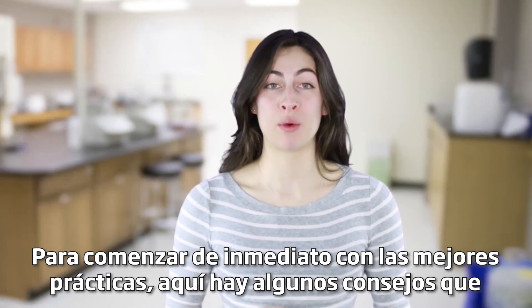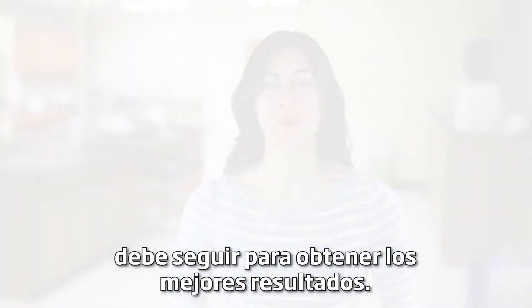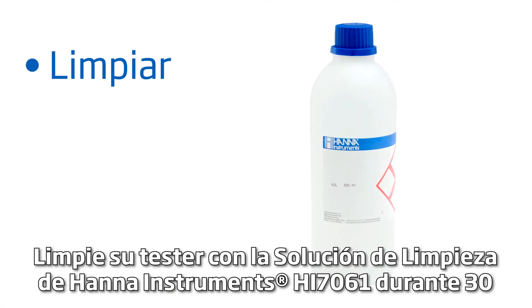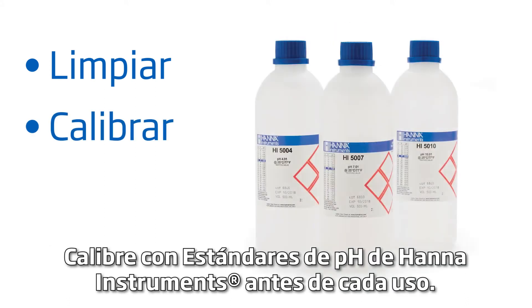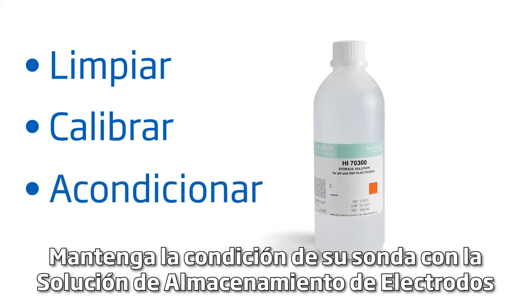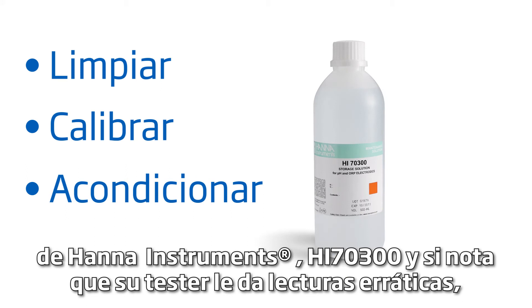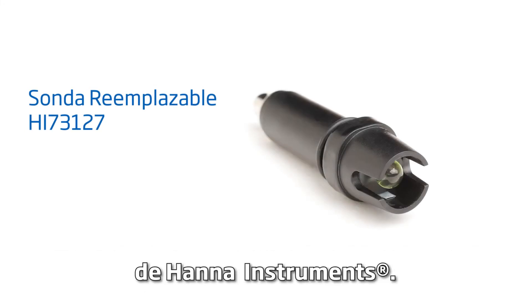To get you started right away with best practices, here are some tips to follow for best results. Clean your tester with pH electrode cleaning solution, our HANA HI7061, for 30 minutes at least once a month. Calibrate with HANA pH buffers before each use. Keep your probe conditioned with electrode storage solution, our HANA HI70300. And if you notice your tester giving you erratic readings, your pH probe is replaceable with our HANA HI73127.